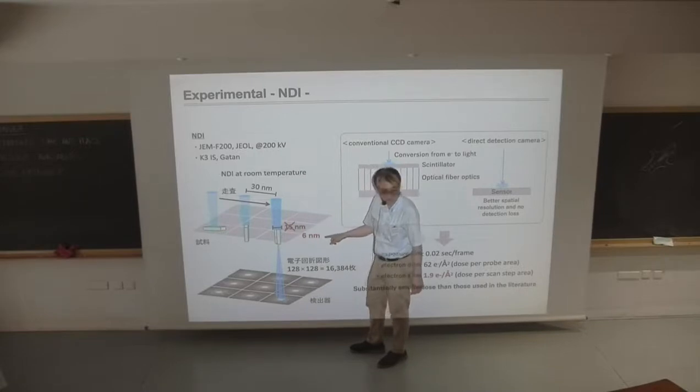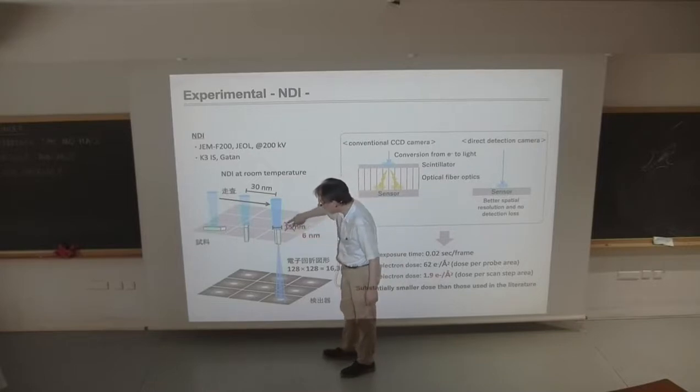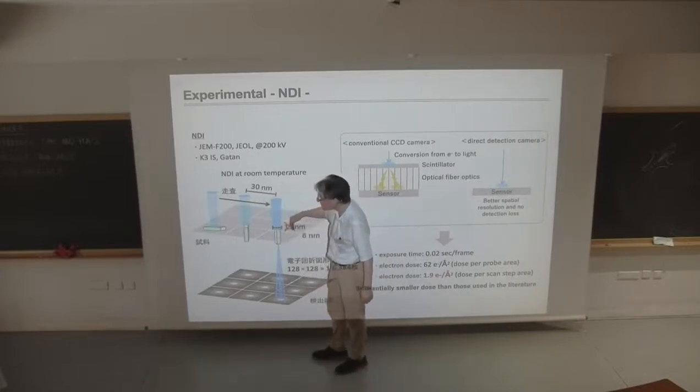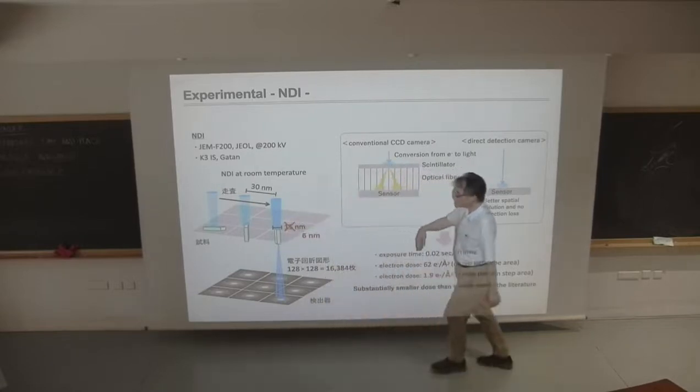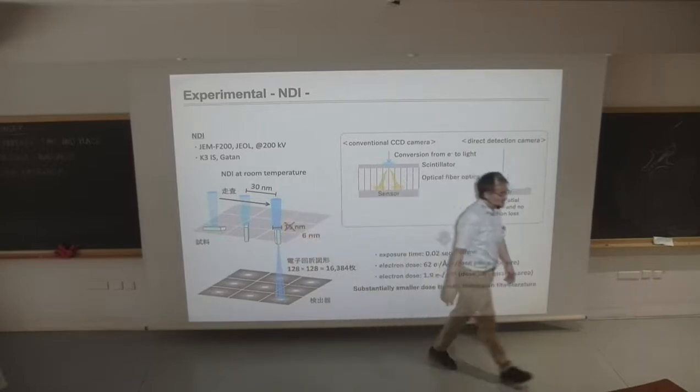In the paper, we write 15 nanometer. That was wrong. I'm sorry. When you happen to read our paper, it is 6 nanometer. That's a miscalculation. Okay, so because we thought it's a 15 nanometer, the step length we set was 30 nanometer, so a very low resolution image. But anyway, like I say, we shine the beam and take the diffractions.